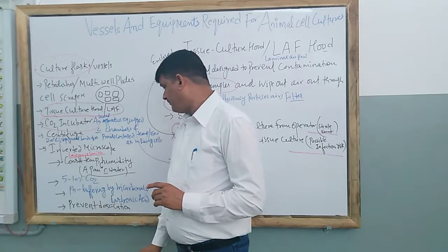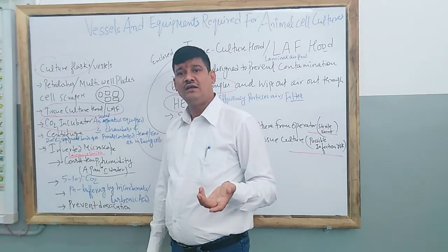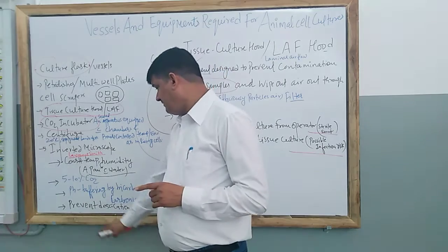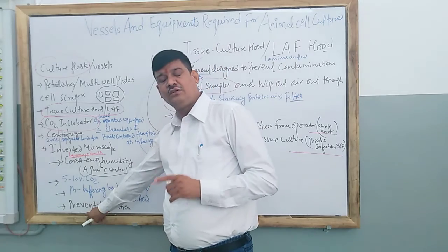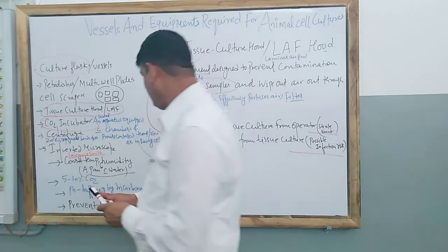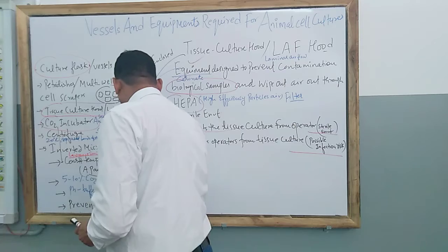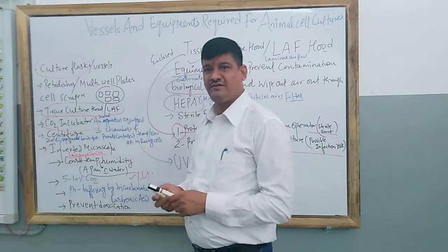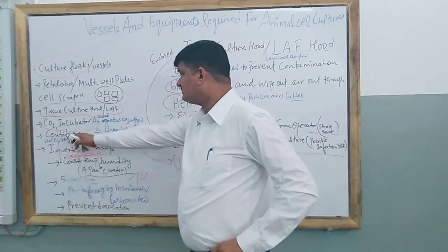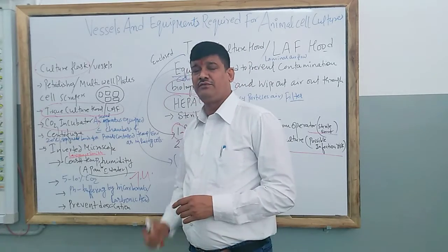Now the pH buffering is done by bicarbonate or carbonic acid, and the best pH for the culturing of cells is 7.4. That is slightly basic. It requires slightly basic. Now the next one is the centrifuge.